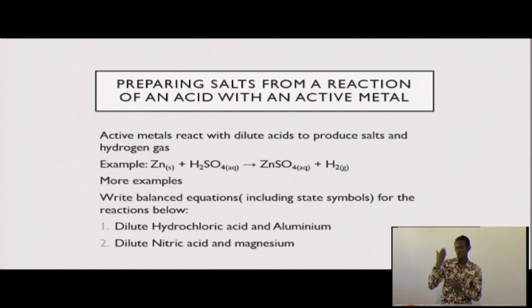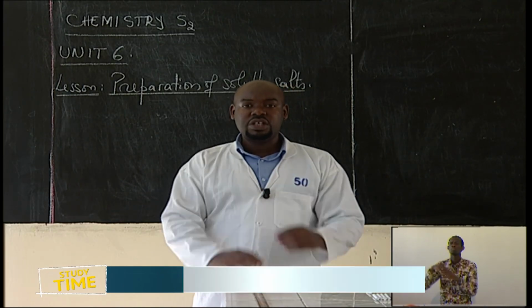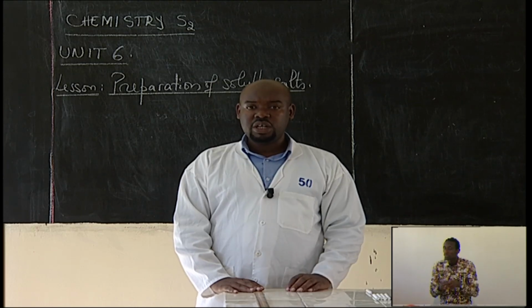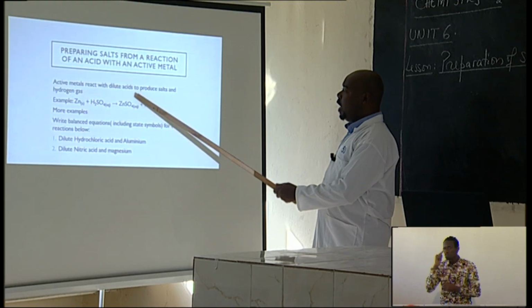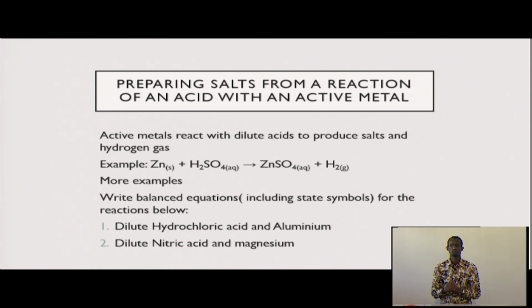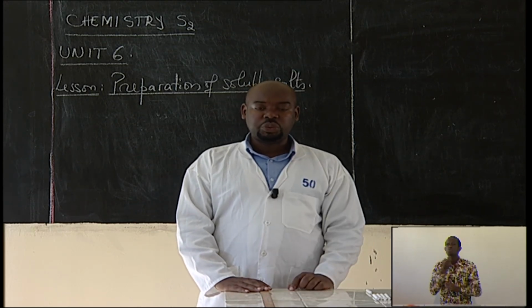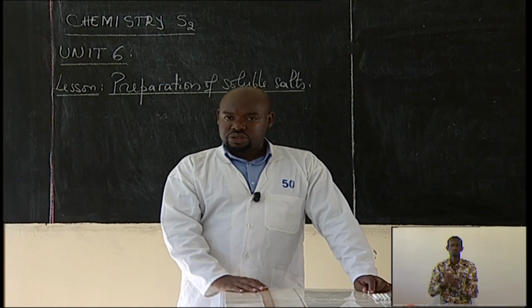You can see that this zinc sulfate is in aqueous solution. What does it mean? It means that our salt is soluble in water, so you cannot have it in the solid state. Here you have to be very careful, because there is something important here we have to note. Because these salts are soluble in water, when you carry out your reaction, they will be produced, but in a dissolved state or in aqueous state. If you want to prepare solid particles of those salts, you should proceed with a process we call crystallization, the formation of crystals. Do you remember how we carry out crystallization?